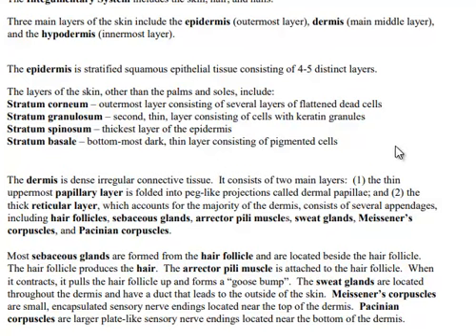And then going down into the dermis, you're getting into the dense, irregular connective tissue. So that was actually a test question that you guys had asking, what is it and where is it? And like in the palm of the hand, places where you need the skin to be able to stretch in different directions, you're going to have the irregular connective tissue instead of linear, where you're only stretching in one direction.